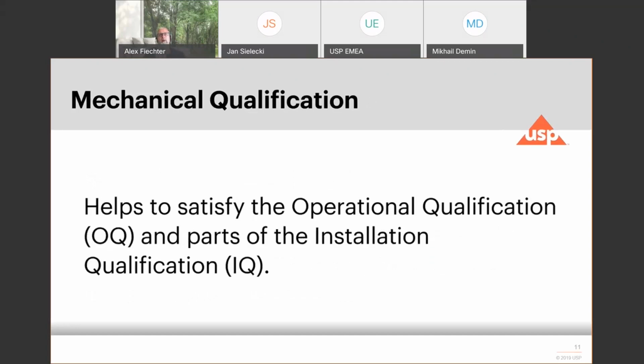The instrument qualification is essential, especially when you have a new equipment. You would want to check every single part that you obtain. There are manual checks that you can do. There are visual checks that you can do. All equipment and all accessories are supposed to be delivered to you according to the specifications of the General 711, and you usually get a certificate of compliance from your supplier.